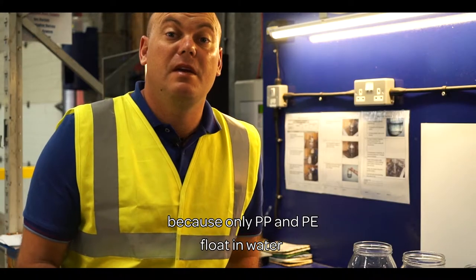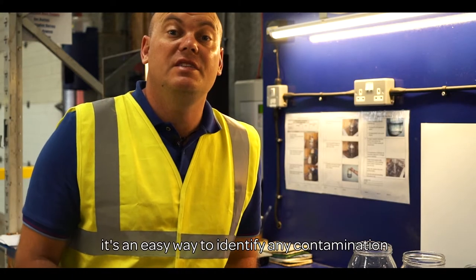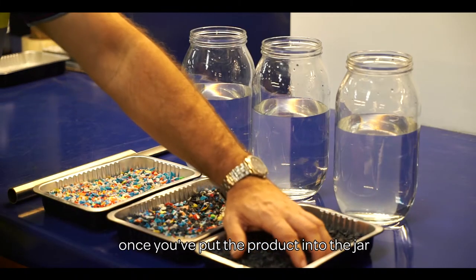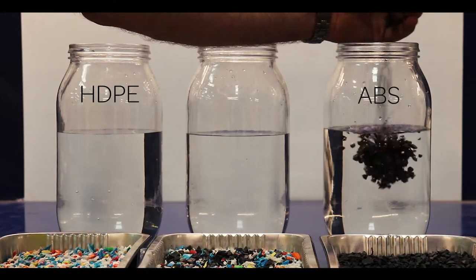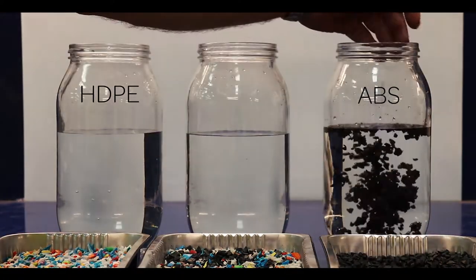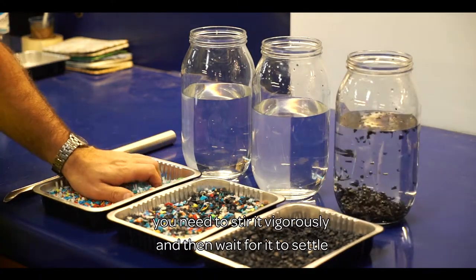Because only PP and PE float in water, it's an easy way to identify any contamination from other polymers or fillers. Once you've put the product into the jar, you need to stir it vigorously and then wait for it to settle.